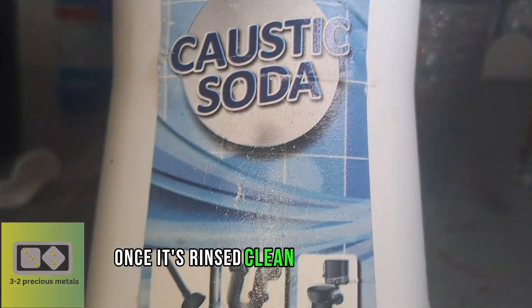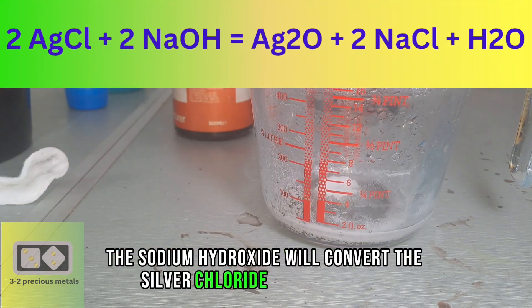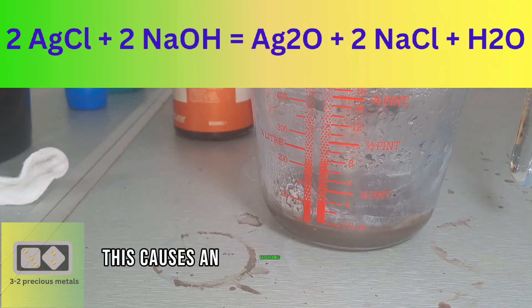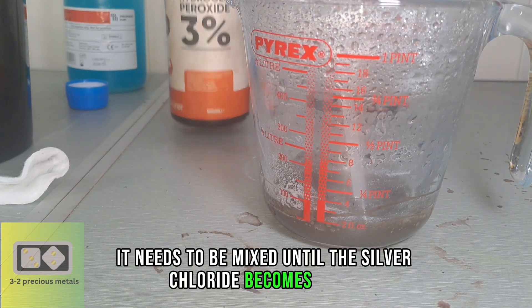Once it's rinsed clean, I can add some sodium hydroxide. The sodium hydroxide will convert the silver chloride to silver oxide. This causes an exothermic reaction and the solution will become hot. It needs to be mixed until the silver chloride becomes black.